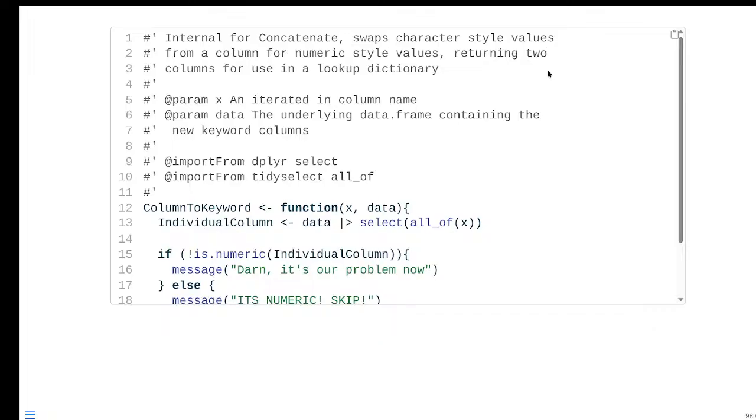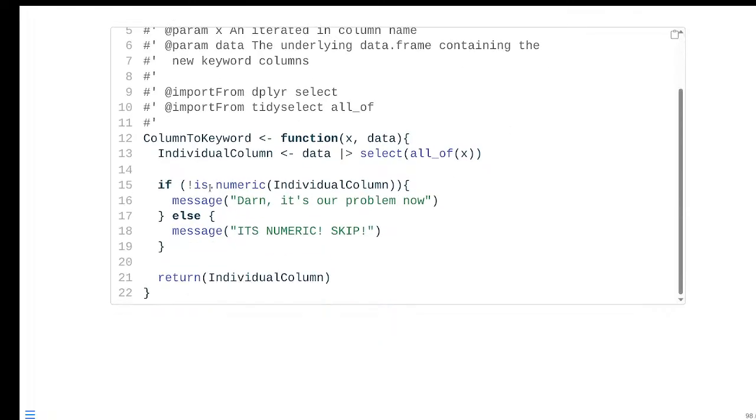So if we are setting up our conditional, once again, basically is.numeric. If you're checking the individual column that we've isolated and checking to see if it's numeric, if the value comes back as true, this little exclamation sign is going to flip it, so it's going to come back as a value of false. So at that point, it would skip down to the very next one. So at that point, since it's actually a numeric column, you can see the message in this case, when this line of code gets run, it'd be "it's a numeric", would be skipped at that point.